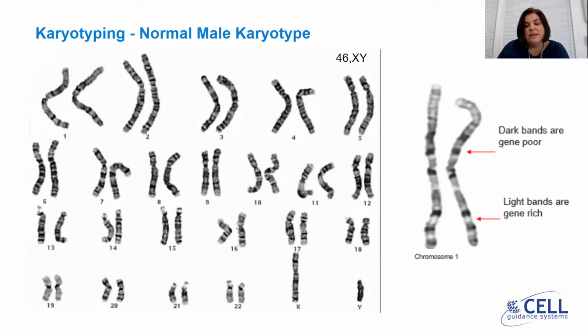We can see on 18q that there are 4 distinct bands, and that makes this at least a quality 4 cell. Typically for embryonic stem cells or induced pluripotent stem cells, quality 3 might be more typical, but it does vary a lot. It can vary within the sample, dependent on the sample type, and it can also vary according to how well the sample has been processed.